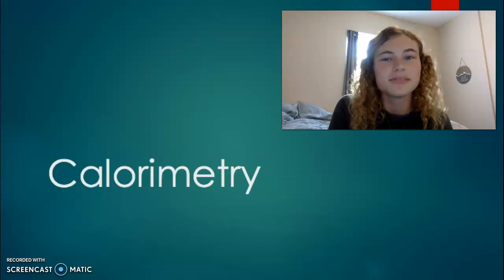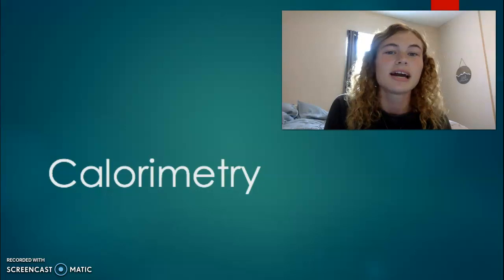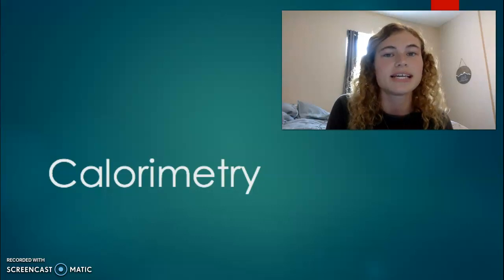Hello, today we're going to be talking about calorimetry. Now, what is calorimetry, you ask? Calorimetry is a lab technique used to measure the heat of a reaction by measuring the change in temperature of the surroundings that takes place during the chemical reaction.